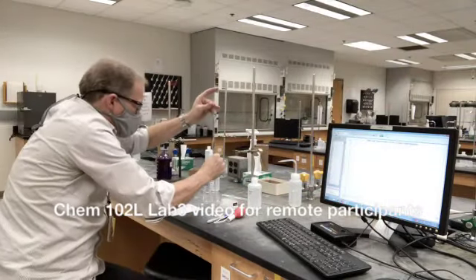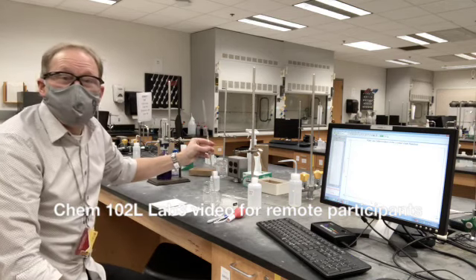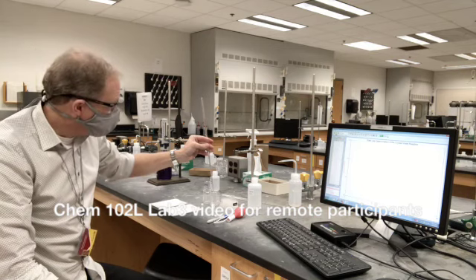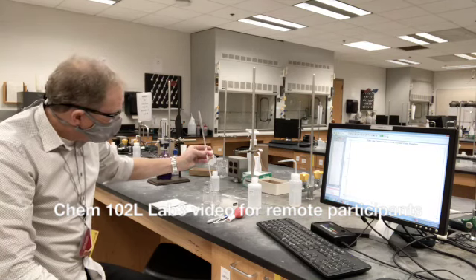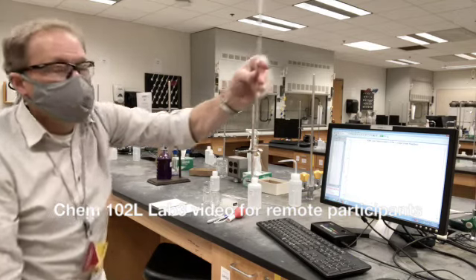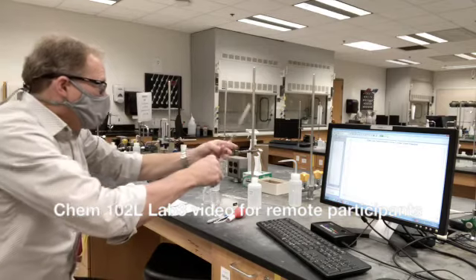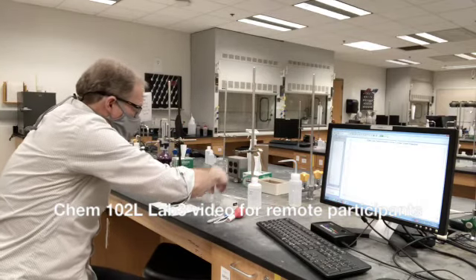That goes into one of the beakers. This is a to-deliver pipette — it has TD written on the side. For chemistry, we just let it deliver the amount and we leave this little bit left in the end of it. That one is sodium hydroxide. So I have 10 ml here.